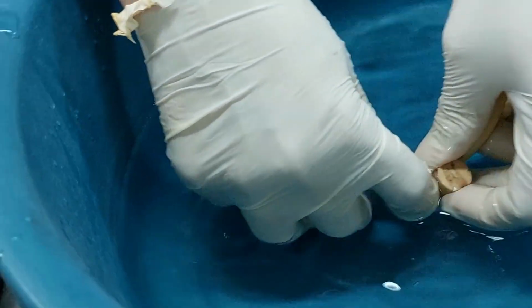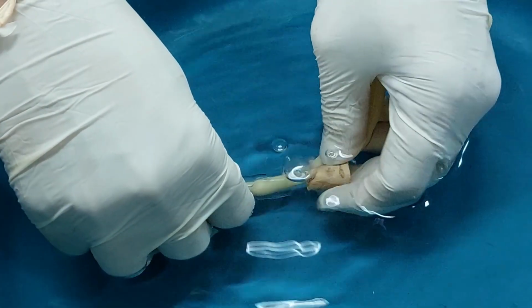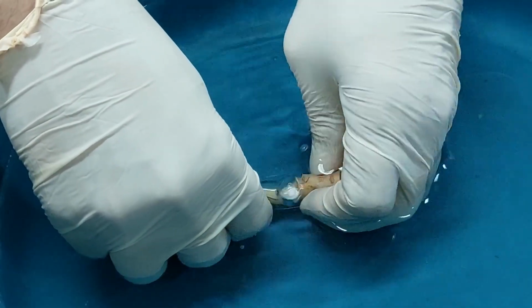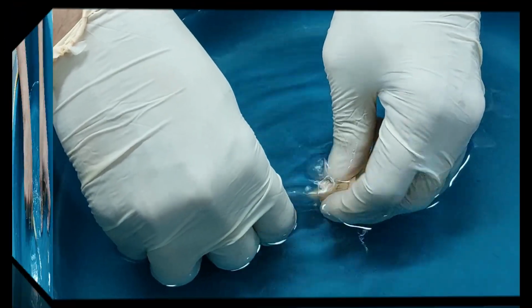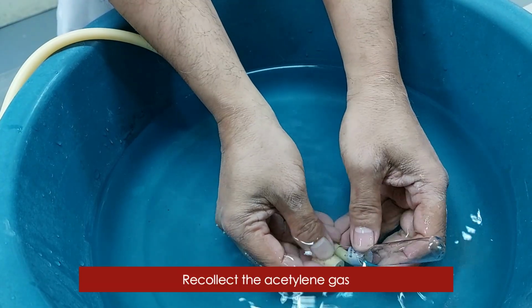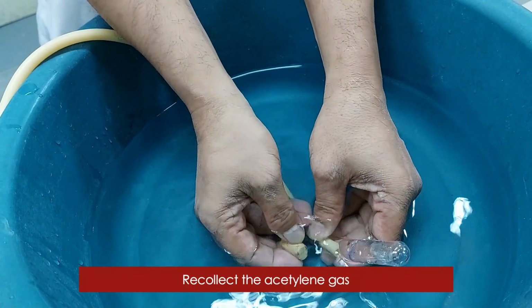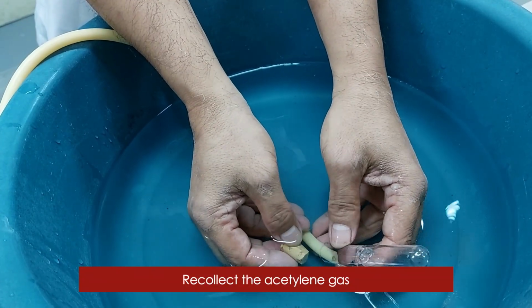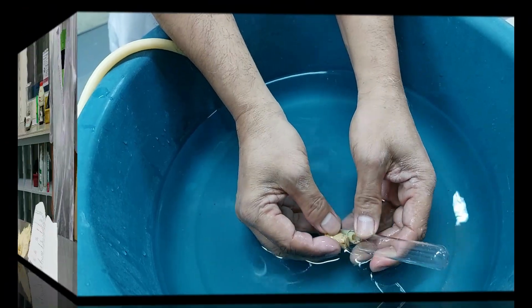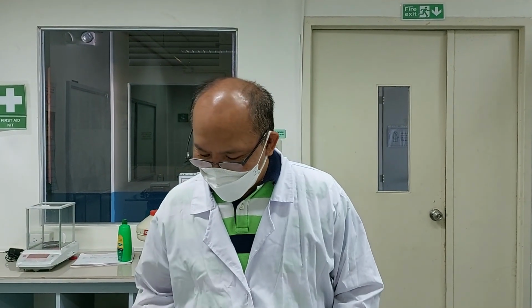There, I think we have the gas already. Okay, so we have collected already our acetylene gas. At first we had difficulty collecting it, but it's okay already now.